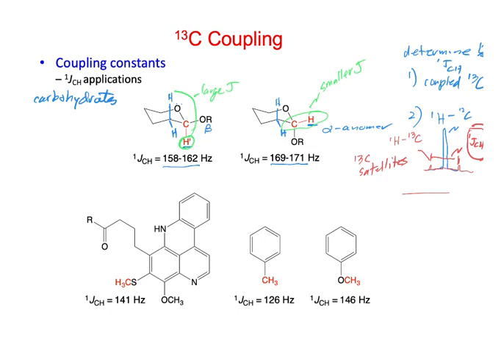Right, so ideally, the more ways you can add to your data that supports a structure, then that's good. All right, so another example, when I was a postdoc, there were people in our group that had isolated this compound from a marine tunicate, a sea squirt. And the question when they were doing this had to do with this methyl group right here.